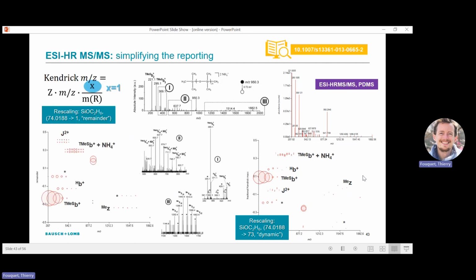To avoid this problem, you can rescale the data using the dynamic definition a bit differently. I don't use a value like 500 or 70, whatever you want to rescale to. I'm using 1 here.